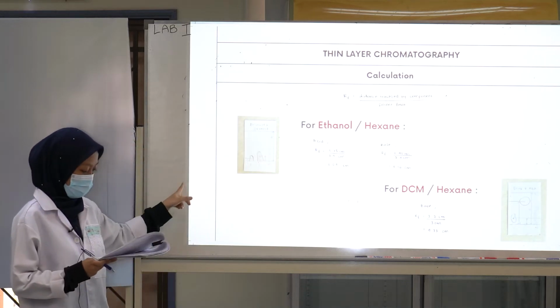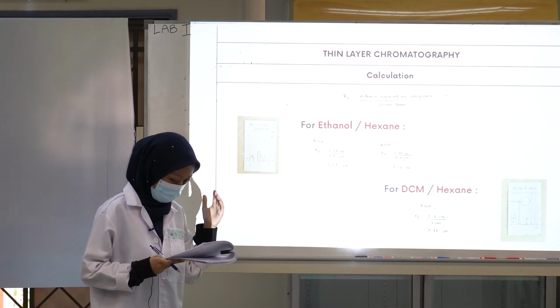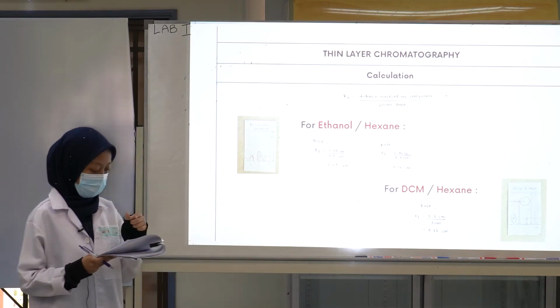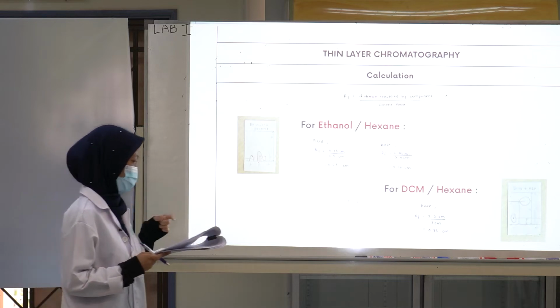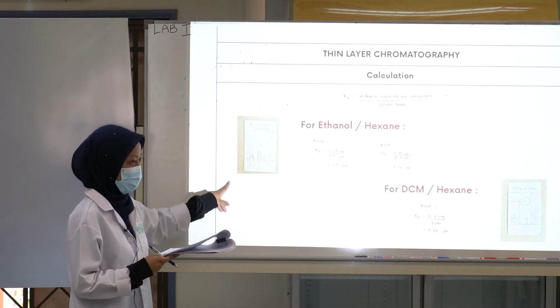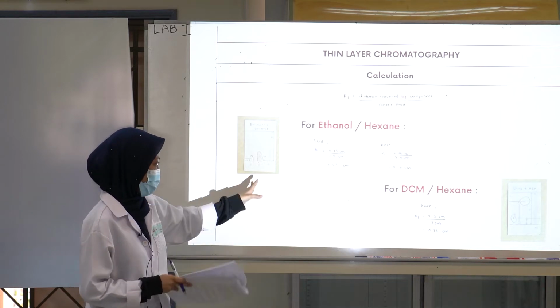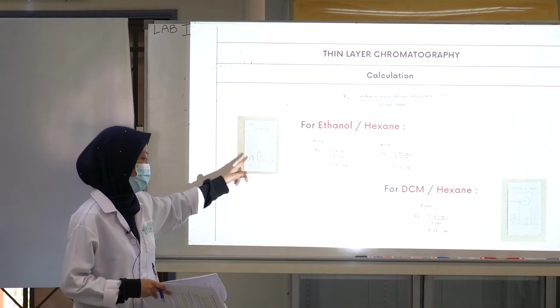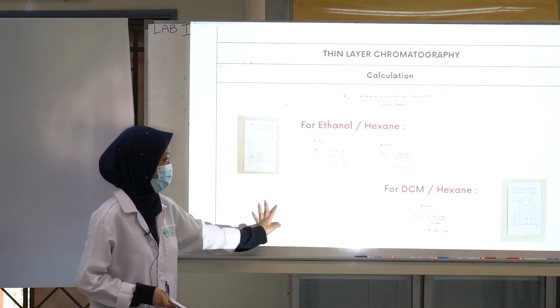So acid has more affinity to the TLC plate. For base, the affinity is more to the solvent.